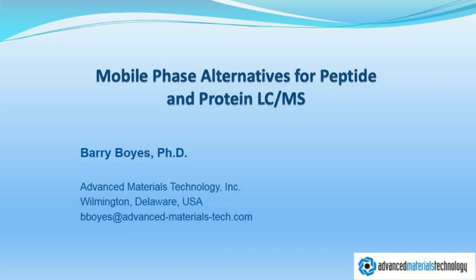Excellent. Let's just do one or two more questions. Do you think that using DMSO in the mobile phase is a good choice to enhance solubility of hydrophobic peptides in MS analysis? I have kind of mixed feelings about that. There have been examples in literature, and certainly in the proteomics literature in recent years, for the addition of DMSO. It's largely been for reasons other than solubility. But that certainly could help.